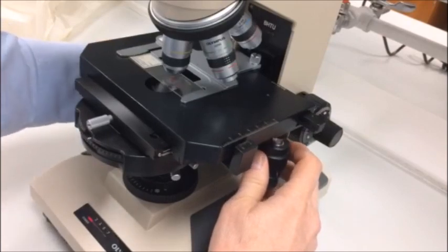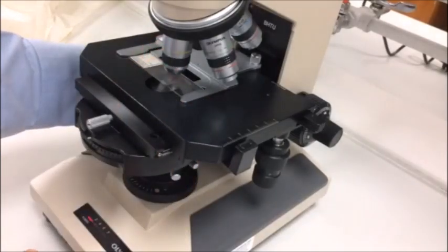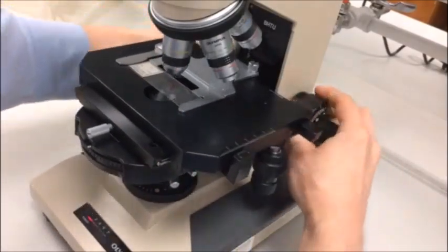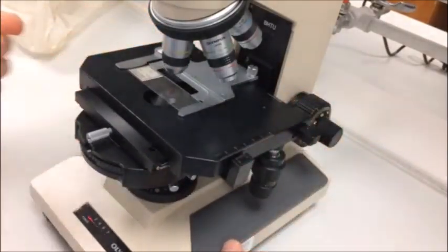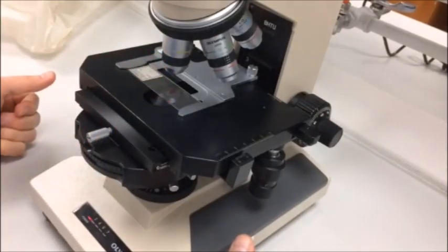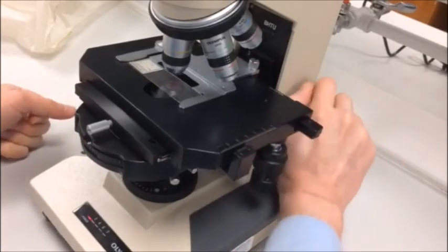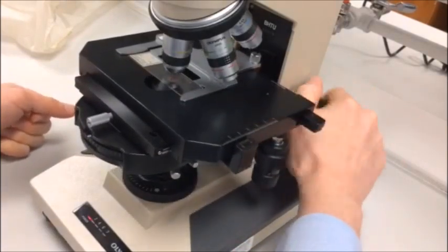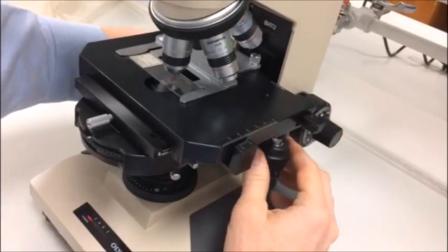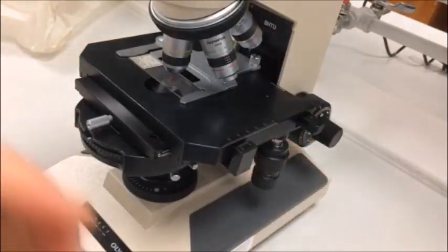A lot of times the object is in focus when it's very near to the objective lens. So if you turn the focusing knob and the stage is way far away from the objective lens, then you probably have gone way too far. It's better to just crank it all the way back up and then slowly move it down while wiggling the mechanical stage until you get it in focus.